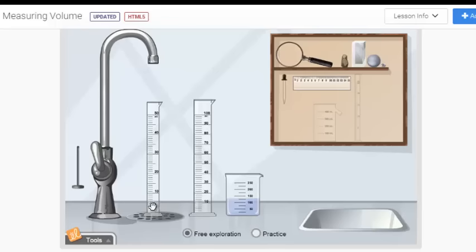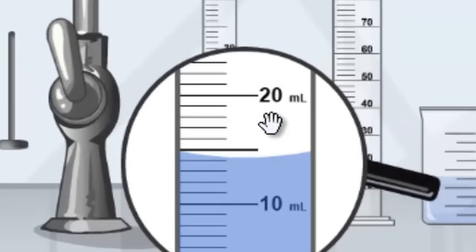First off, in some activities I may ask you to fill up the graduated cylinder to a certain milliliter mark. For example, let's say I want you to fill this graduated cylinder up to 15 milliliters. You might take a beaker and pour in a bunch of water and then take a look to see if we're close or if we're there. What you want to do is get down and get eye level with the graduated cylinder so you can see the top of the water. The next thing you want to do is figure out how many milliliters each line is worth. I know that between 10 milliliters and 20 milliliters I have a difference of 10 mils, so I just have to figure out how much each line is worth.